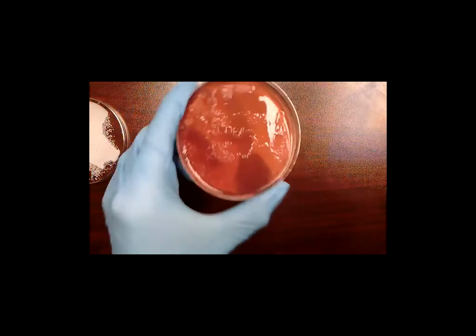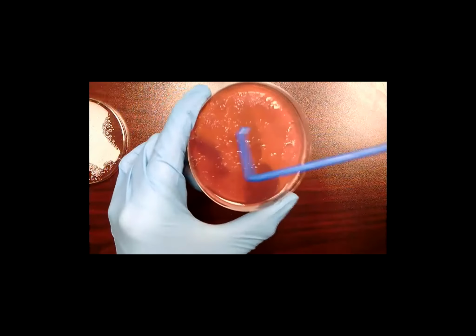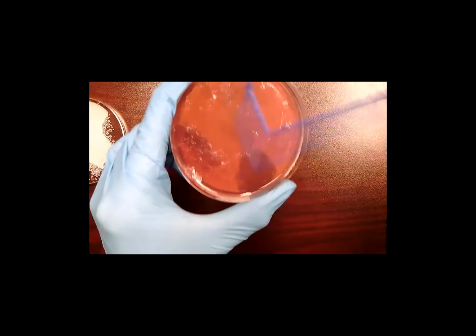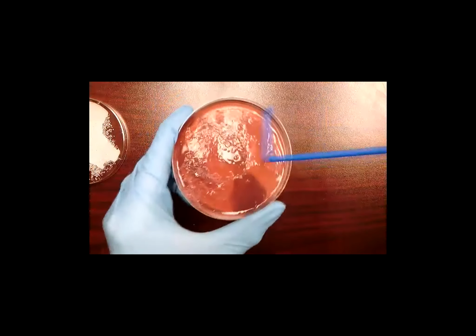And what you're seeing, the funny looking stuff on this agar right now, these actually froze in our refrigerator today. Yeah, they're little pieces of frozen chunks of the agar. So that's not good, but that's what we have right now.